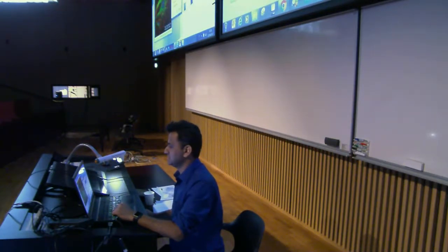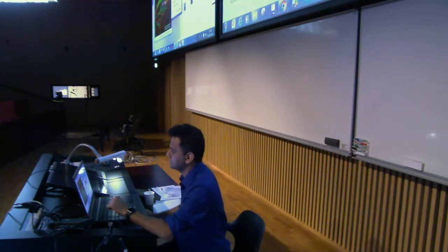Background doesn't matter. The location is important. Maybe if you're not interested in putting it in a different quadrant, but the region of your interest, then you select the location at selection. So now because we have selected this line over here, the scale bar would come up here.